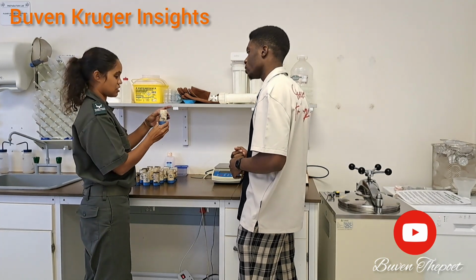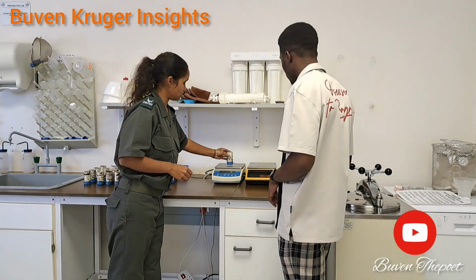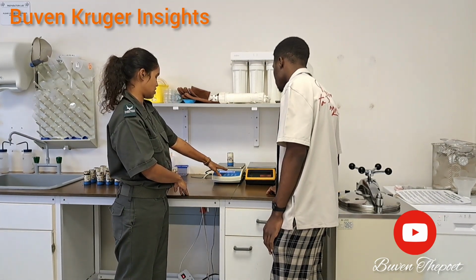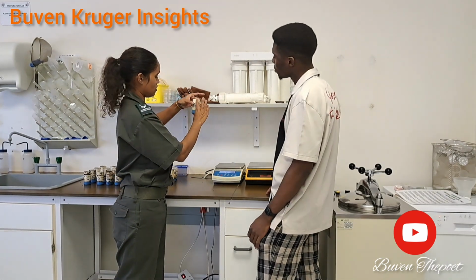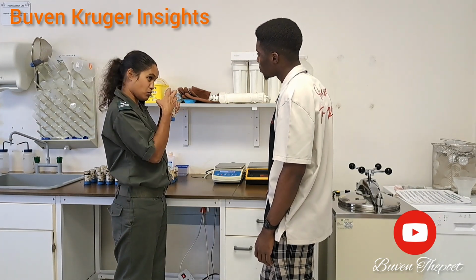So what we do is we take the soil sample in the field and bring it to the lab, and then we measure the weight of that sample. So this is 137 grams at the moment. What it's measuring is the weight of the container, the weight of the soil, and the weight of the water between the soil particles.